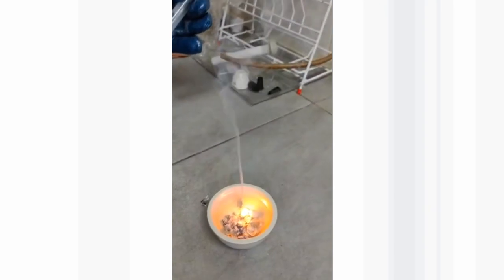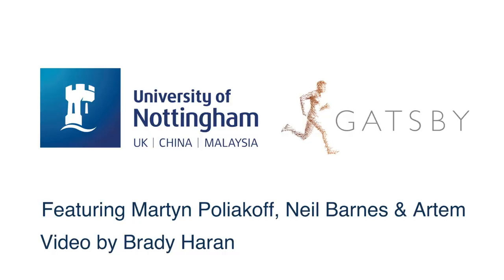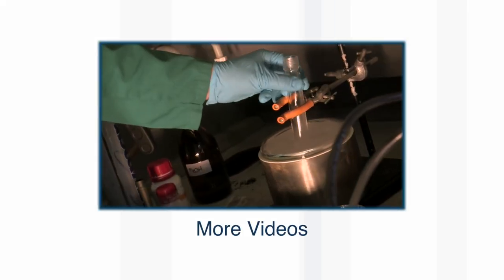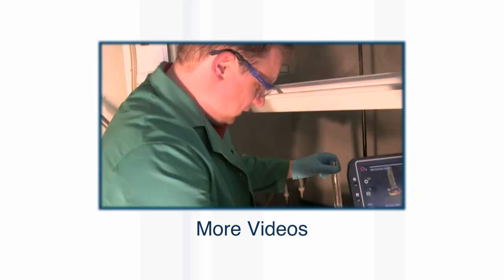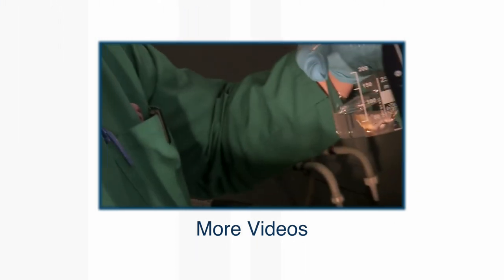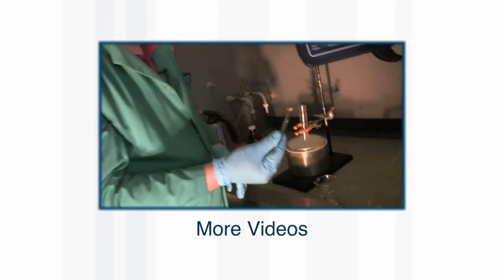So Neil and I both felt we'd learnt something. And of course, Brady always learned something. Dunk it back into the cold bath, just to stop all the ammonia from boiling off. So we've cut some sodium up. We had a big lump of sodium. Cut some bits off that. And we're going to put smaller chunks in.